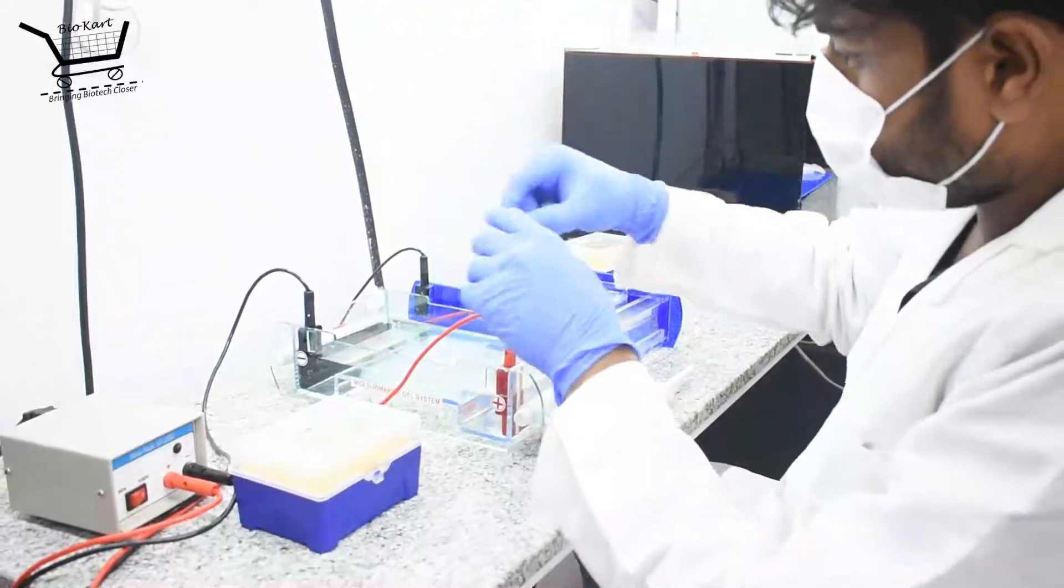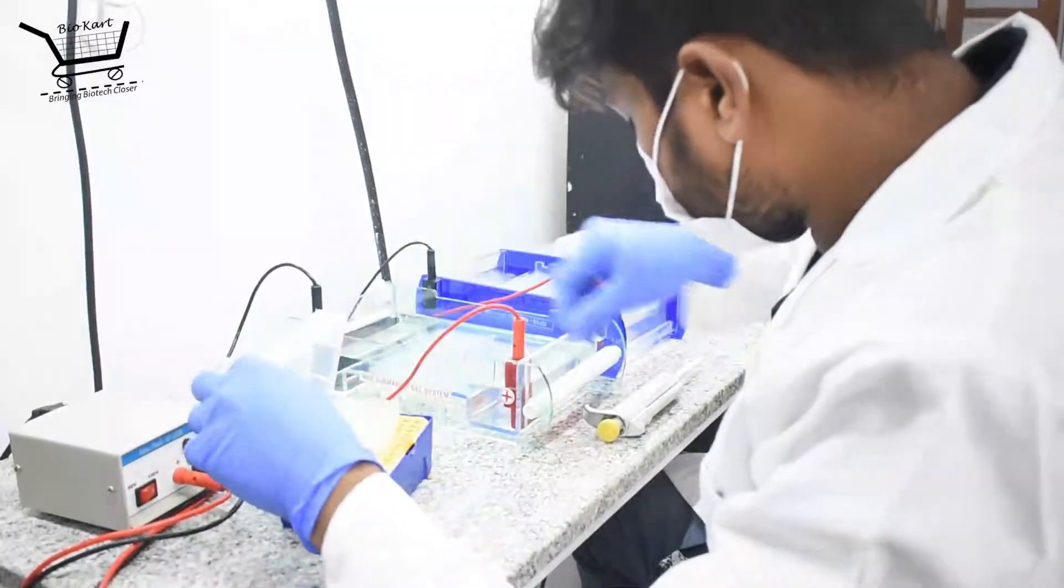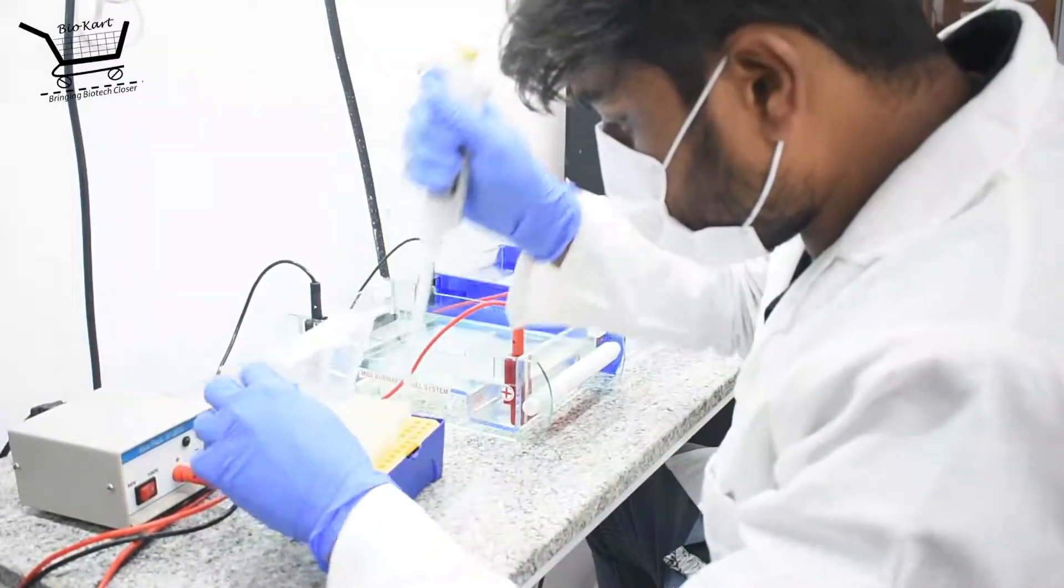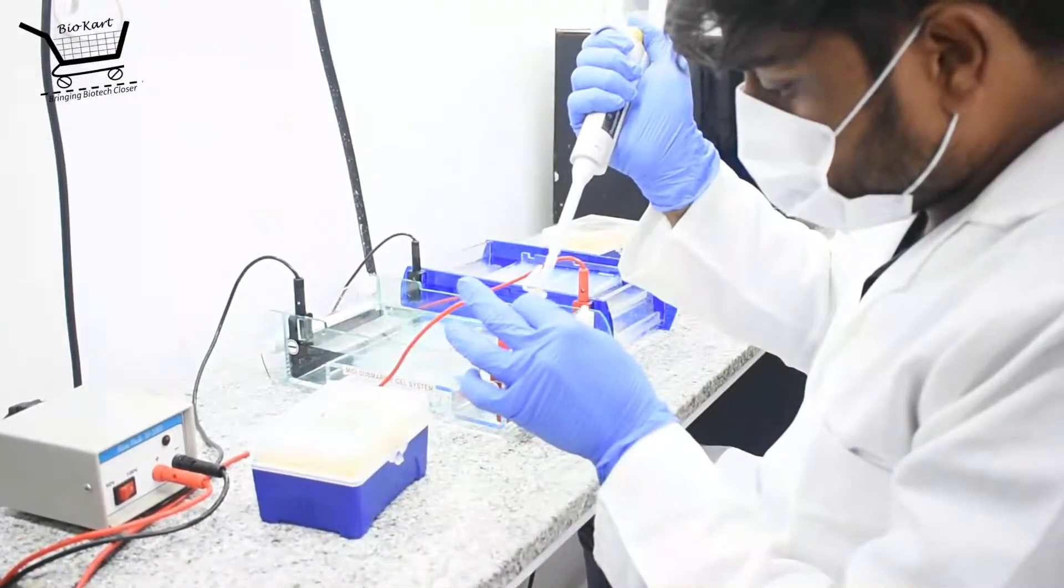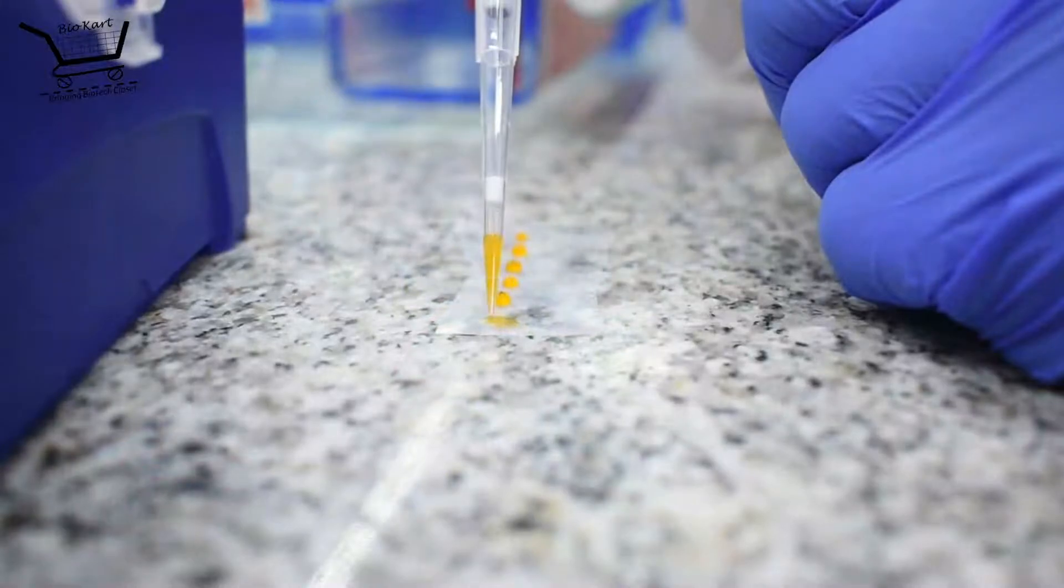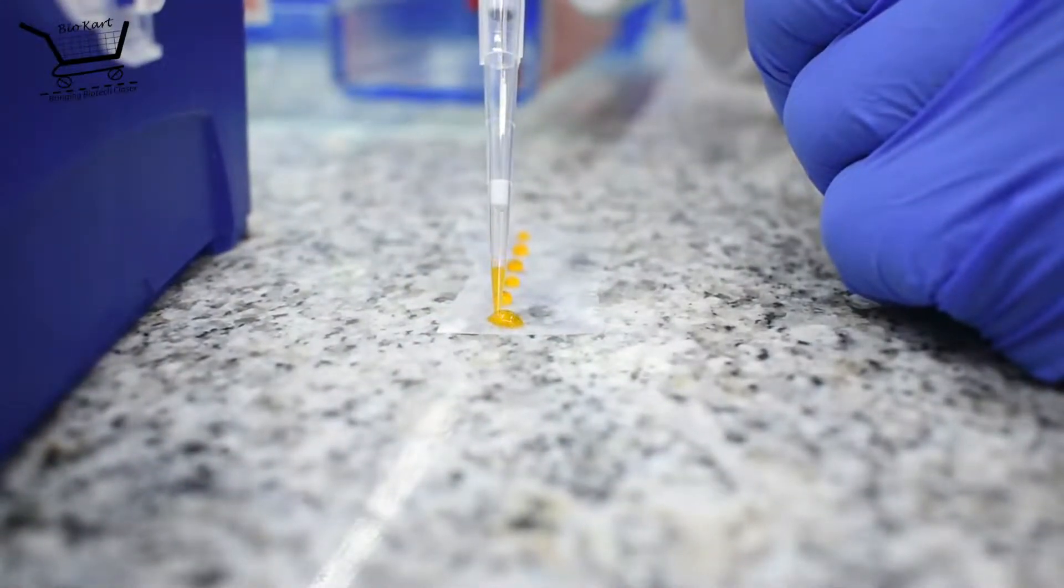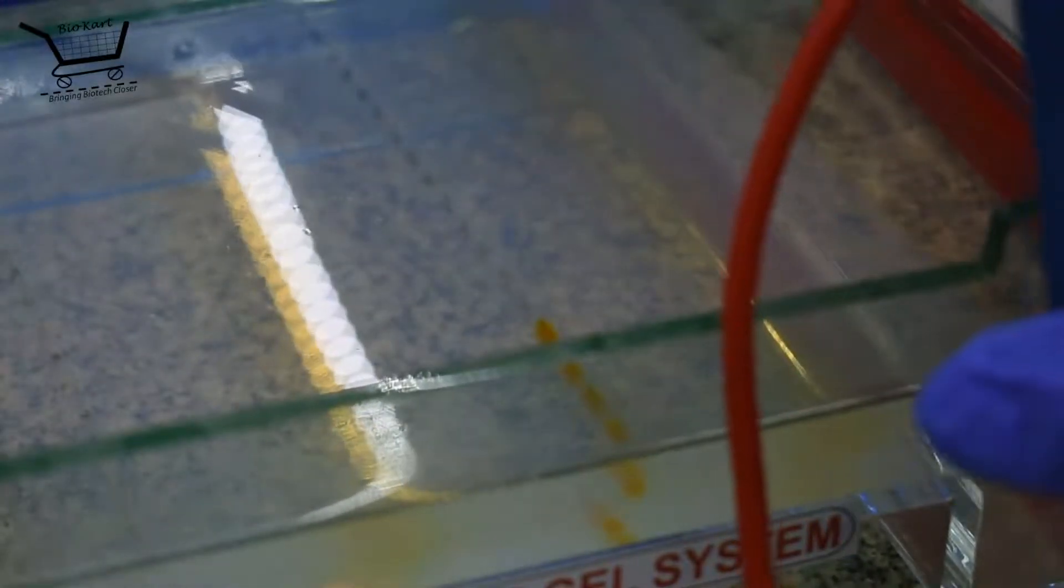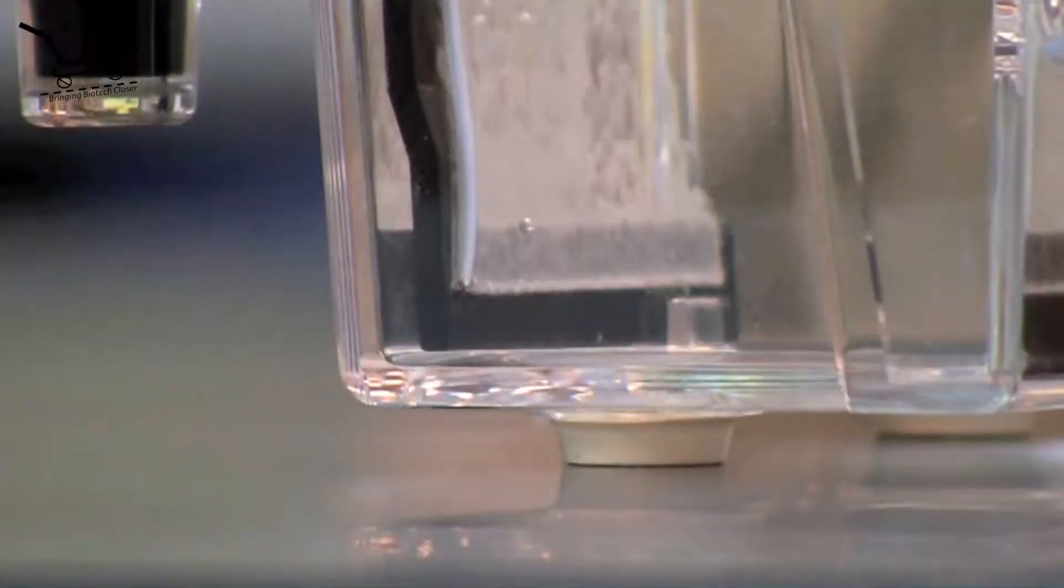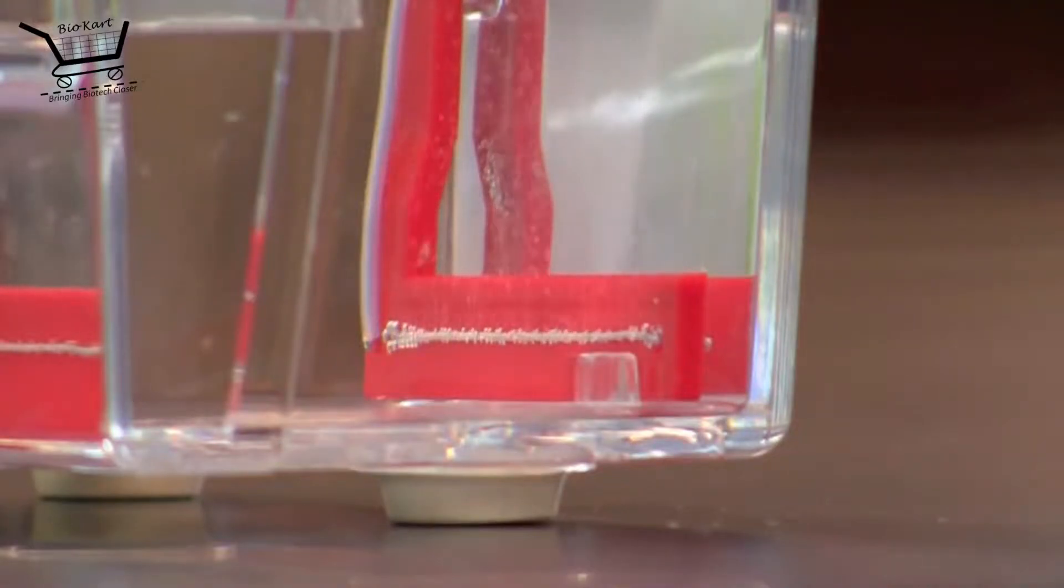When DNA is the starting material, the first step is the quality check or QC. Quality checks are critical throughout the library preparation and sequencing process, involving multiple checks at various points of the workflow. The first check which will be done is the genomic DNA QC. Here the DNA is subjected to both a gel check as well as a concentration check.